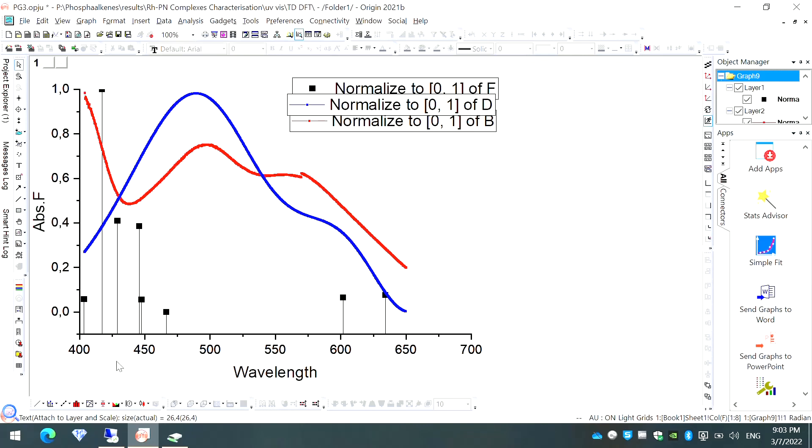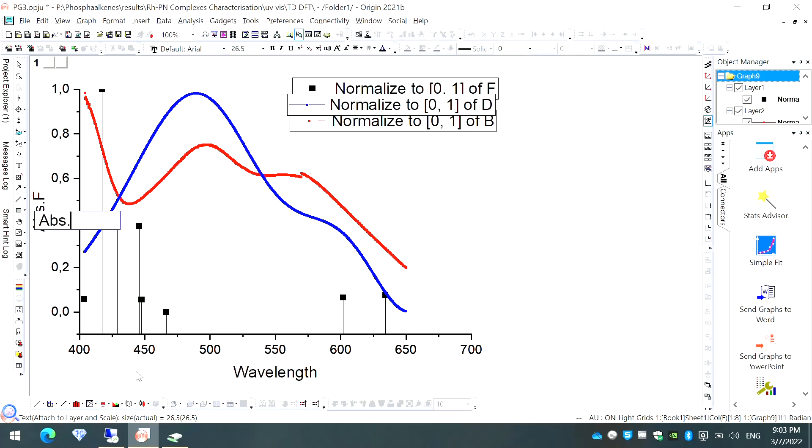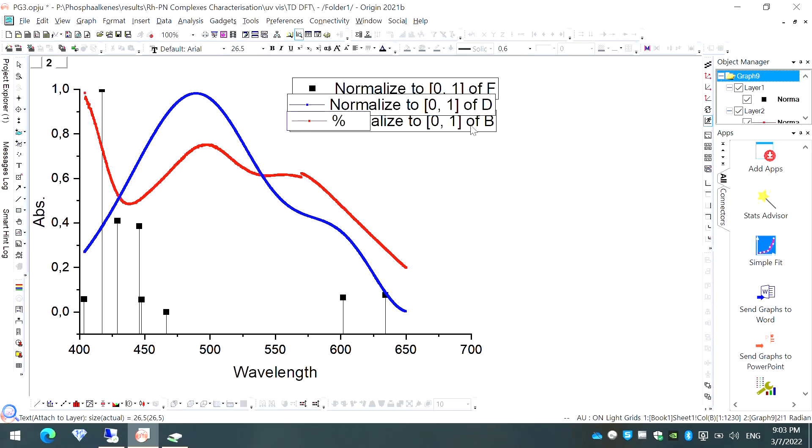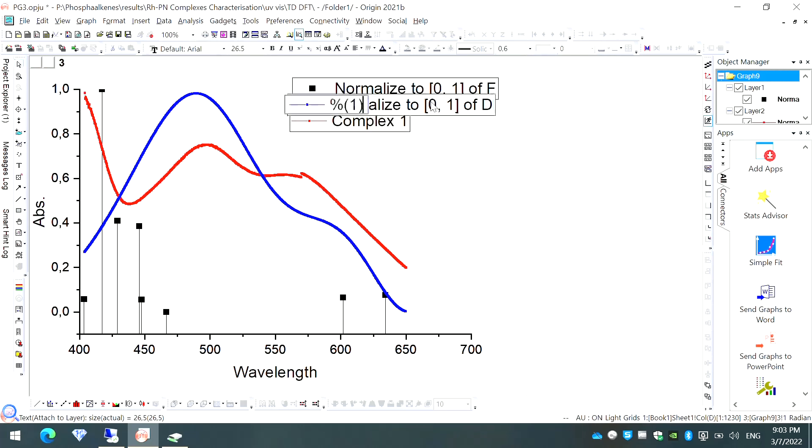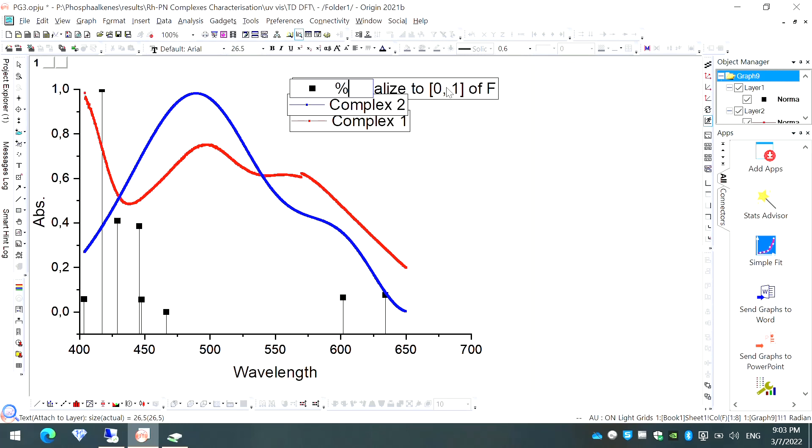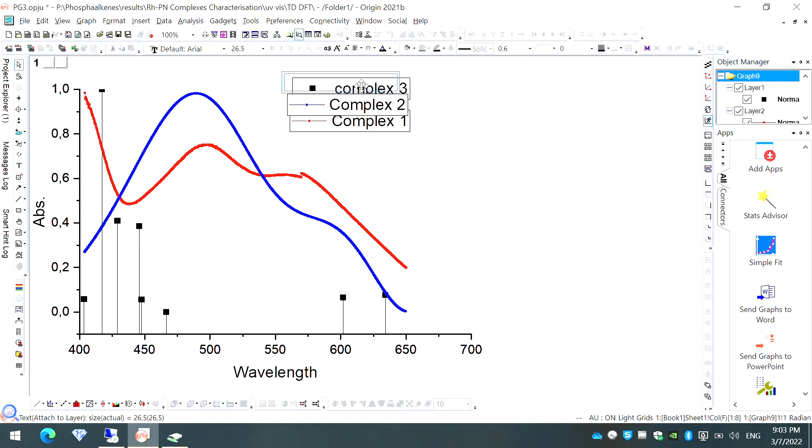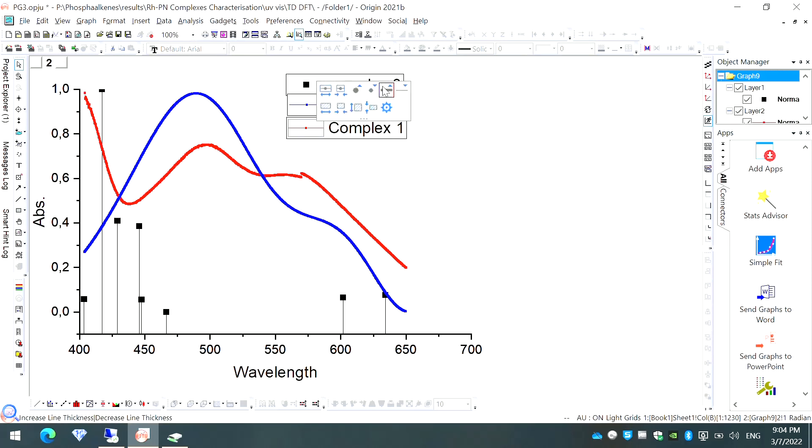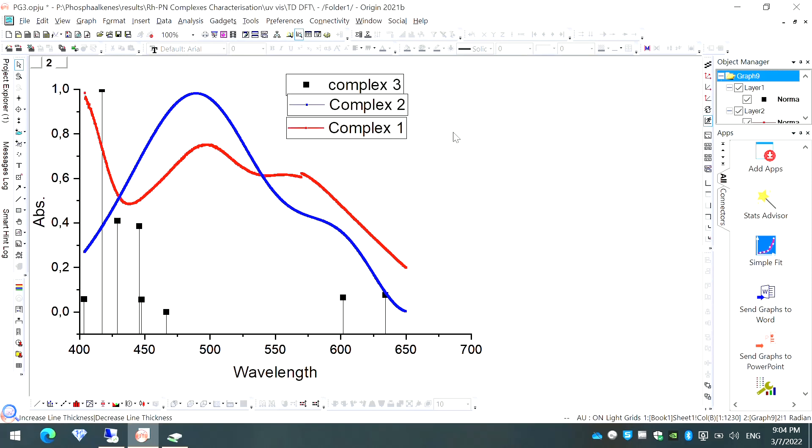You can just write absorbance here. As you can see, we can edit obviously like this and it depends on you what you want to write here. For example, you can just say the red line is my complex 1, blue line is my complex 2, and then maybe these black lines correspond to complex 3. You can do something like that and arrange them properly. That all can be done. You can play around, you can increase and decrease the width as you might have seen in my previous video of Origin. Using that video, you can just edit this graph according to your own wish.